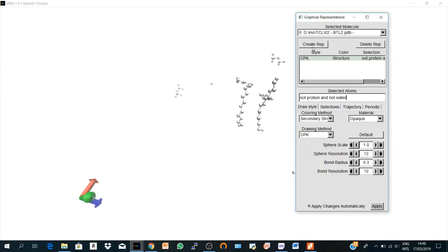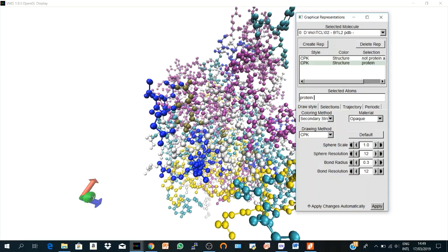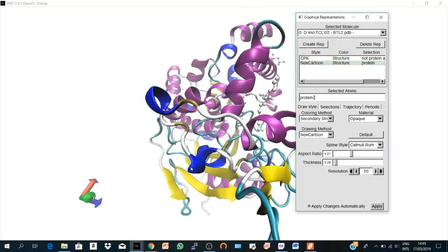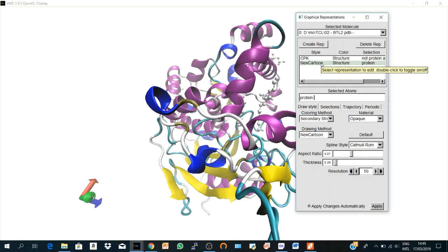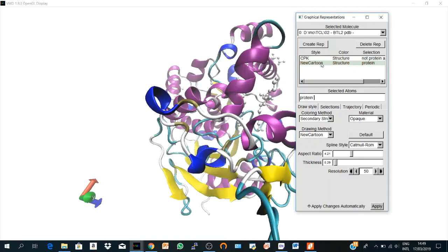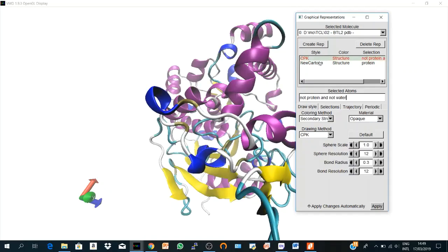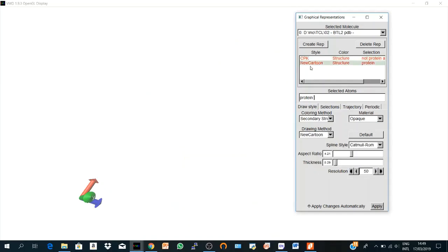Also I can create another representation. Let's get our protein representation back if we say protein. Okay. And let's go to New Cartoon. So I have the two representations together. So if I want to hide one of them, you double-click here. So you have nothing here. You get it back. And here also.